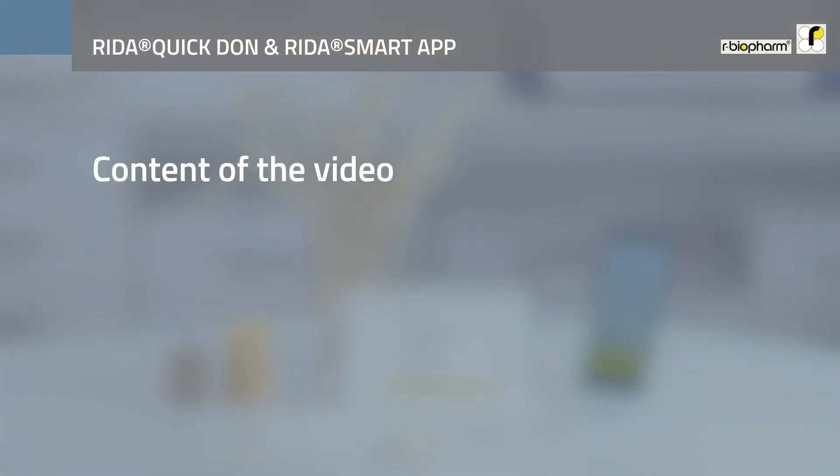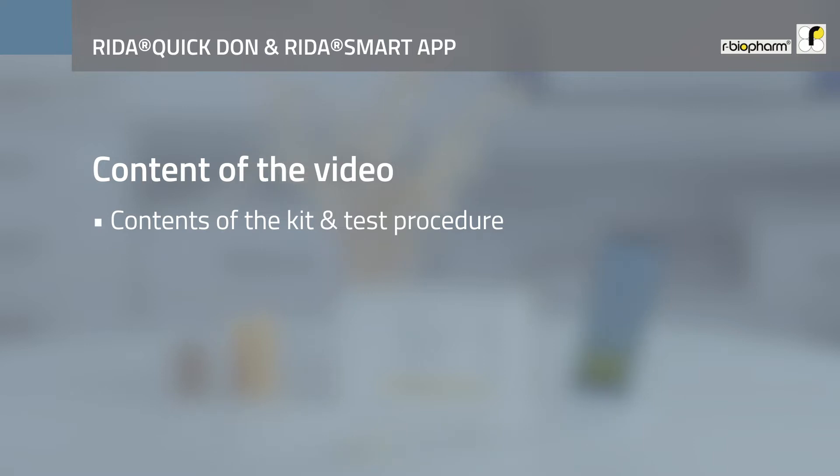First of all we would like to introduce you to the contents of the test kit and how it is processed. Then we will look together at the analysis and interpretation of the test results with the RIDA Smart App.